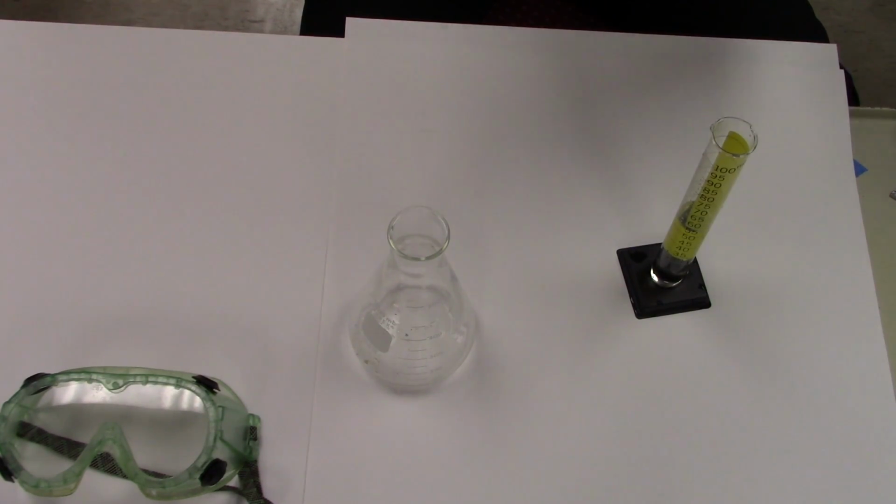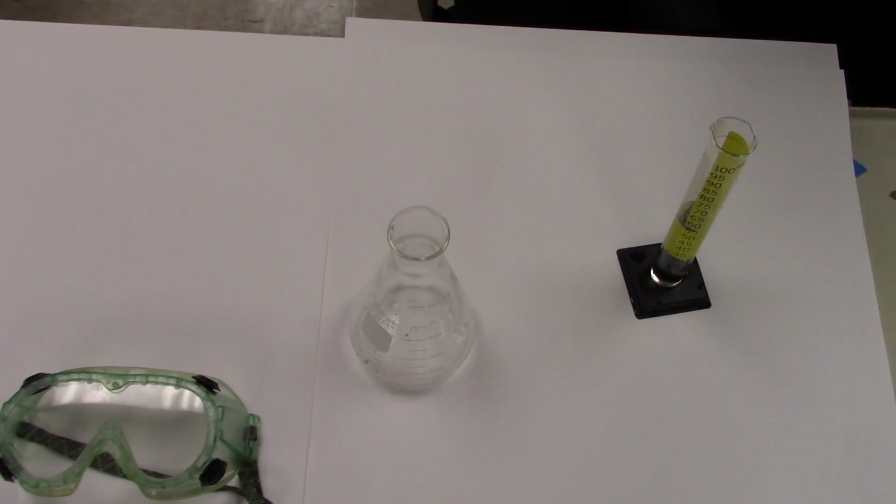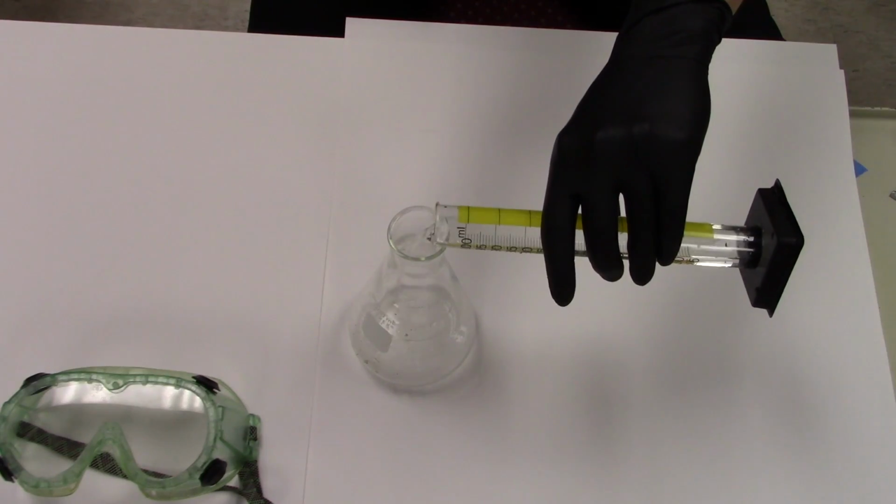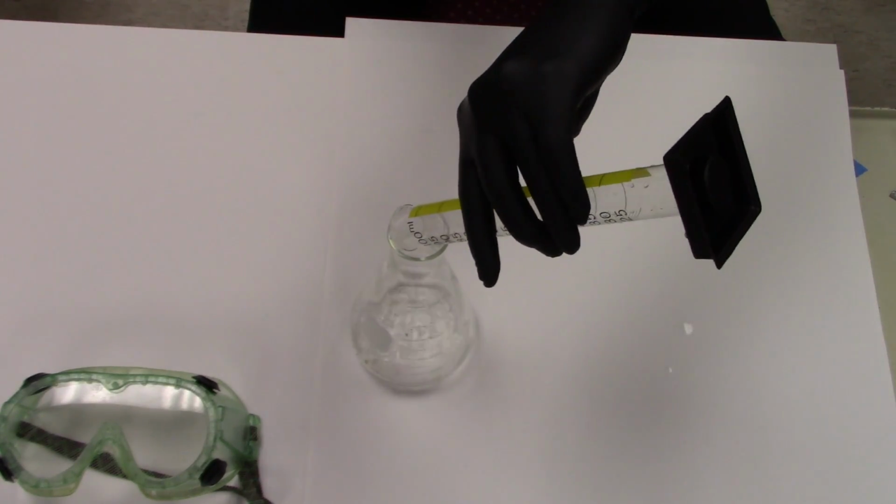It's really weak. It comes in this funny little accordion container so that if it drops, it can't break, because it's super dangerous, kind of. But you guys aren't in any danger, don't worry. So anyways, this is 30% hydrogen peroxide. I don't know if I said that, so we'll put that in here.